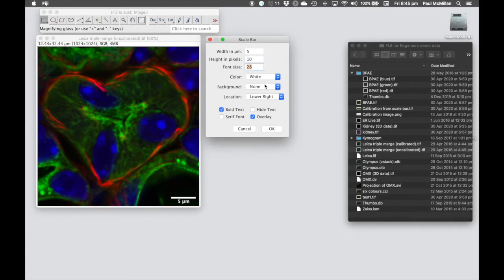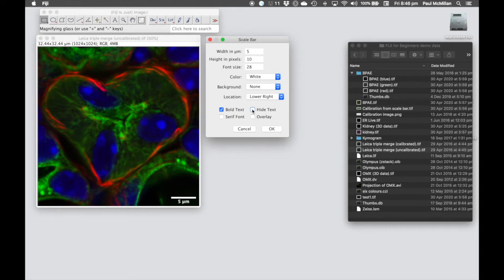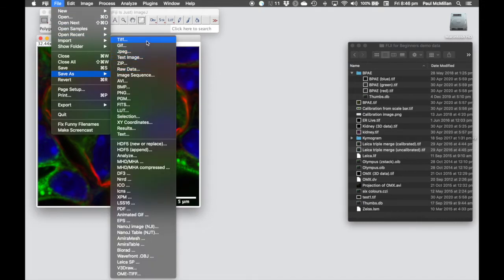You can change the font size, font color, and background. You can position the scale bar in any of the four corners or a custom location. I often save a version without text and a version with text, and I always save the scale bar length in the file name. Once you hit OK, that's burnt into the image. Then save as File, Save as, TIFF.